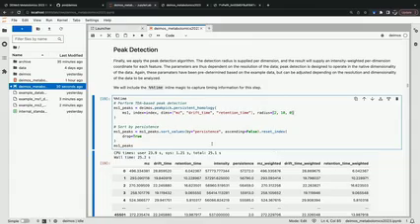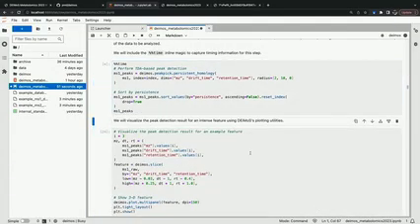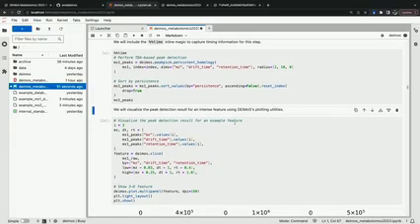These parameters are dependent on the resolution of your data, and again, we've predetermined these based on existing data sets on our end, but those can be adjusted based on the resolution of your instrument and data as well. So now that we have our MS1 data smooth, we'll perform peak detection.